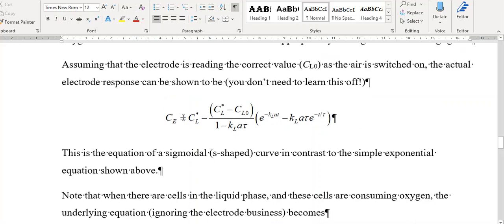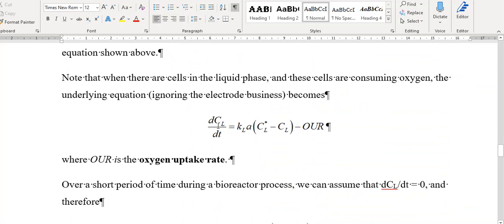Okay, one of the things we'll do next year, which is a really lovely experiment, even if I do say so myself, it's all down to David Cunningham, who did all the groundwork on this, and we've been running it for a good few years now. It's probably the best experiment we do in third year, where over the course of a day we grow yeast cells. We used to use just baker's yeast. Last year, we used Kluyveromyces marxianus, which grows very quickly. Probably too quickly in some ways, so we might have to slow it down.